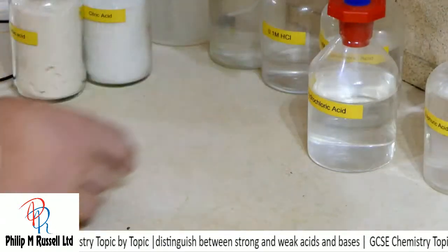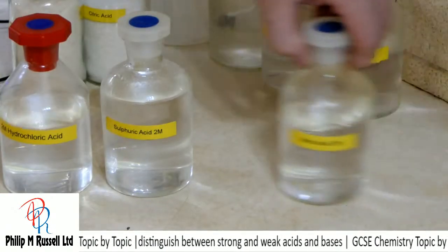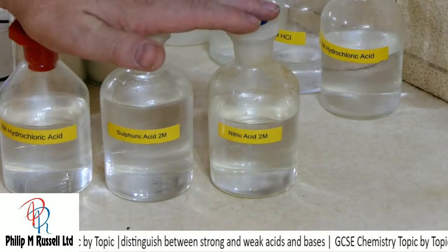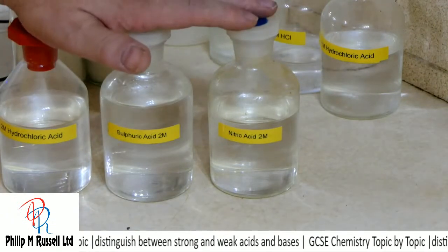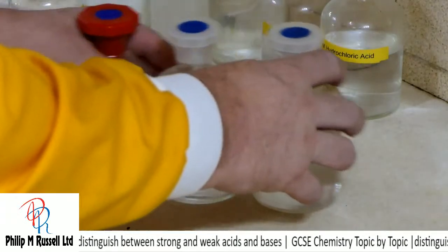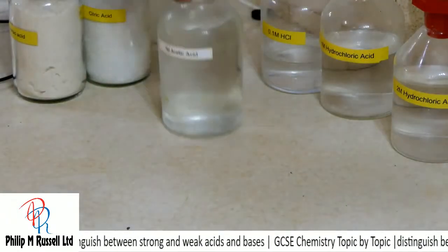We've got some other acids we can have a look at. We've got 3 acids here, all the same strength: hydrochloric acid, sulfuric acid, and nitric acid, called the bench acids or the mineral acids. I've got a variety of other acids.